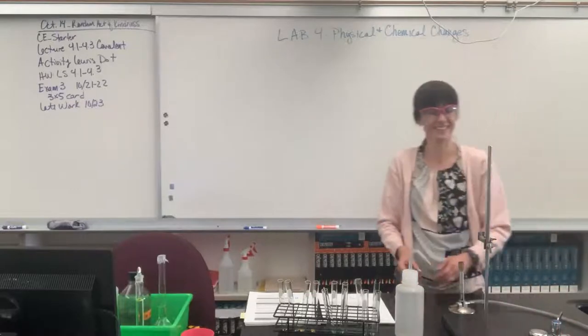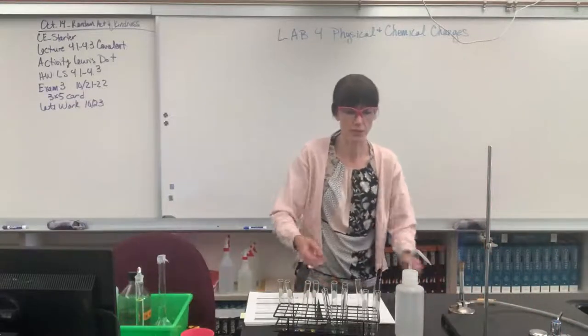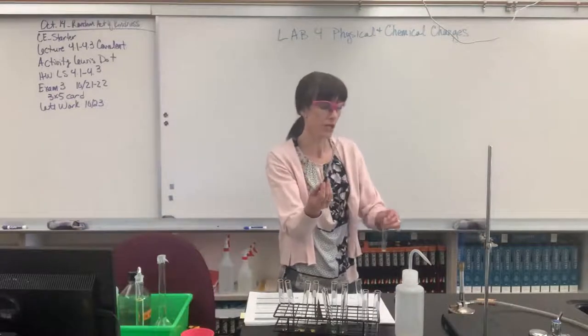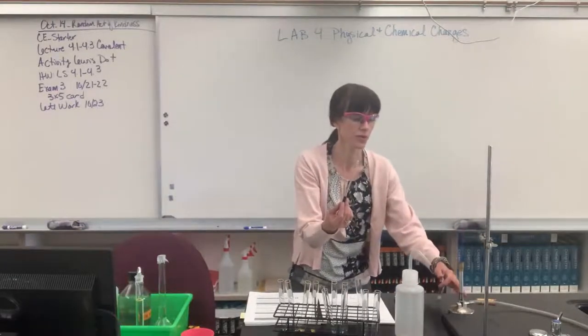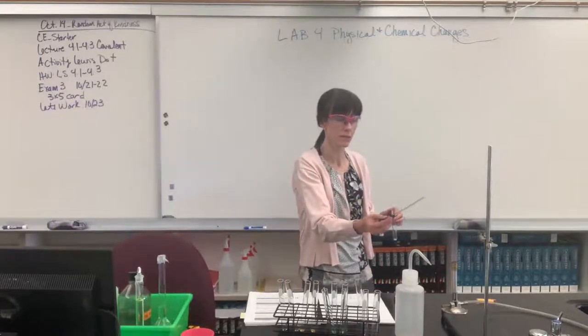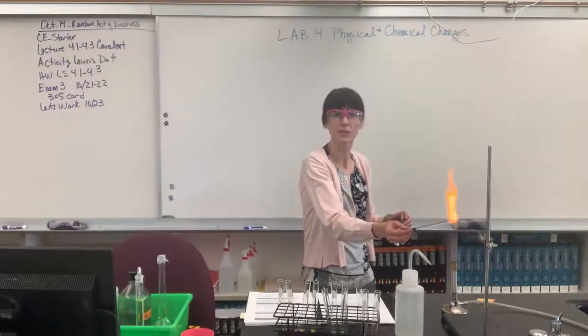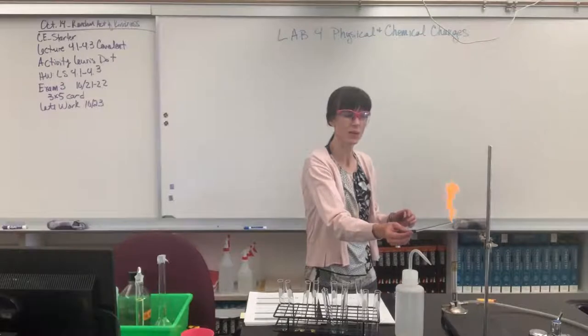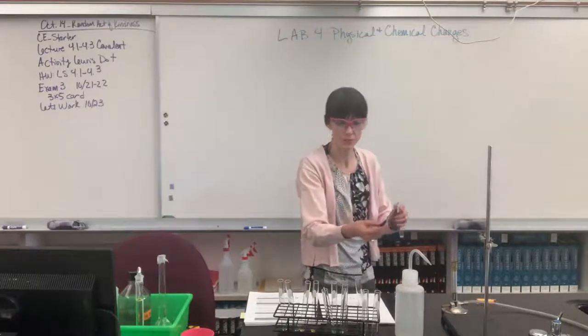There we go. Okay, so we've got our Bunsen burner going. I have the salt on the end and you want to carefully watch. You're looking for the color. What is going to be the color when I put the salt in this flame? So here we go. Oh, that's a brilliant yellow. Nice, nice. It's actually the sodium ion that turns yellow. Isn't that cool? Woohoo! It's just fun doing that.